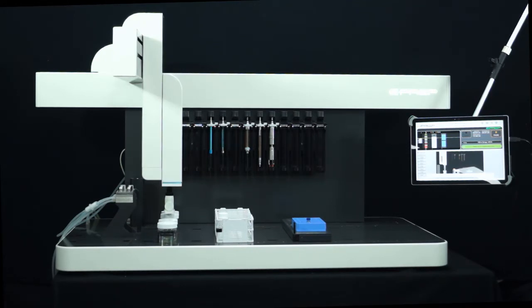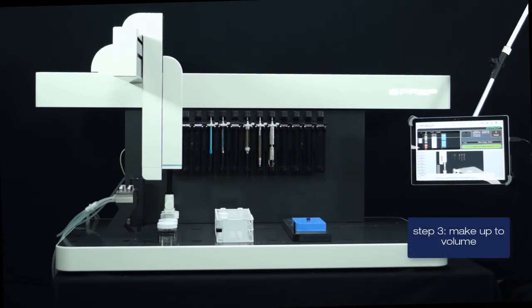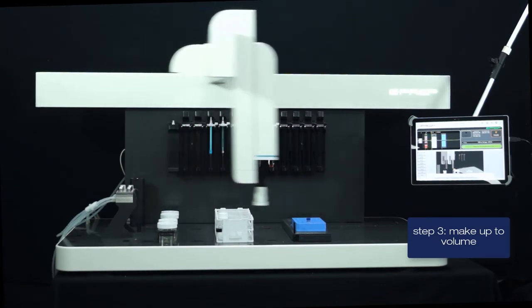The third and final step is the volume is made up to 1 ml for a final concentration of 20 parts per million.